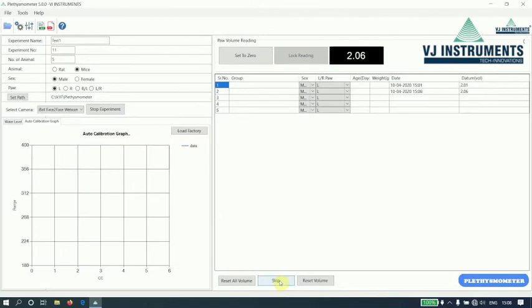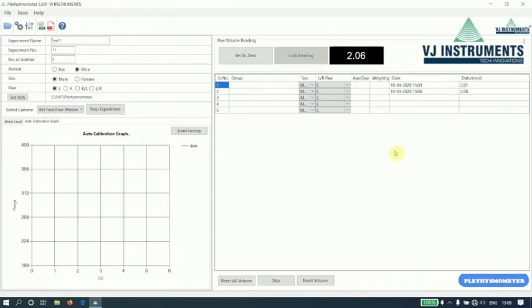This skip button is used to skip the current experiment. The reset volume button is used to reset the current value and perform the experiment again for that particular serial number. And reset all volume button is used to reset all the values and perform the experiment again.